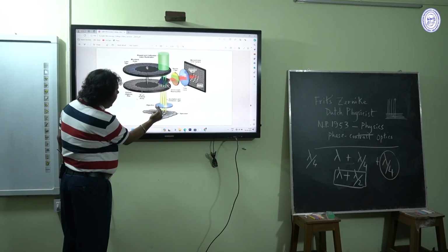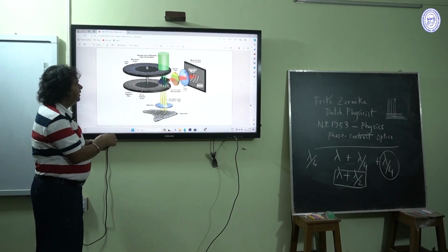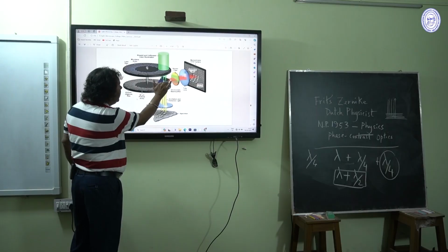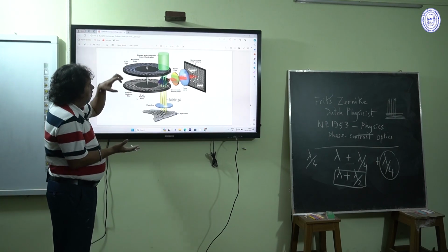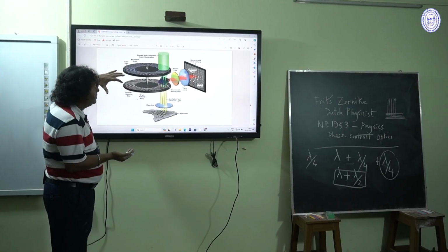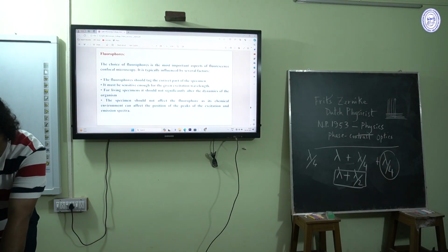In this way, thousands of images are created, and then it will strike the dichroic mirror, then the barrier filter. After that, it will be captured on the monochrome CCD camera. Thousands of images.